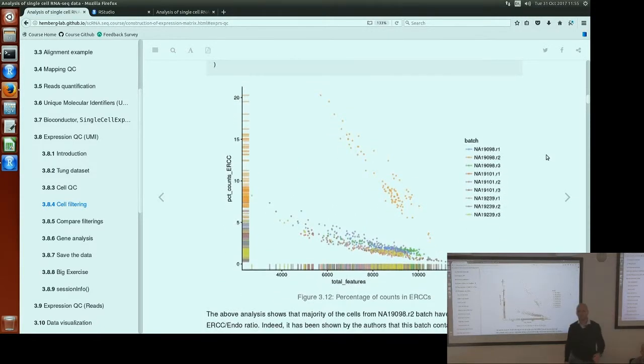But then those cells were filtered out at the beginning when we looked at the amount of transcripts per cell. So this suggests that even though the original amount of RNA or cDNA sequence was low, the number of transcripts for those cells was good enough to pass the beginning of the QC.